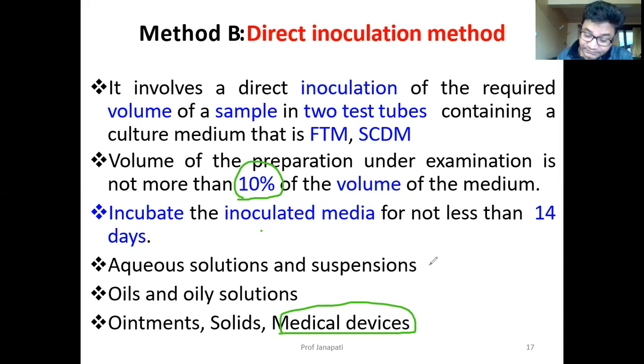subjected to the test. Suppose it is cotton, you can take the sample specified and just place it in the mediums. If it is a gadget, you can do the same thing.